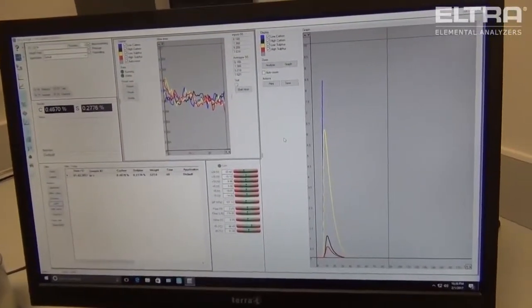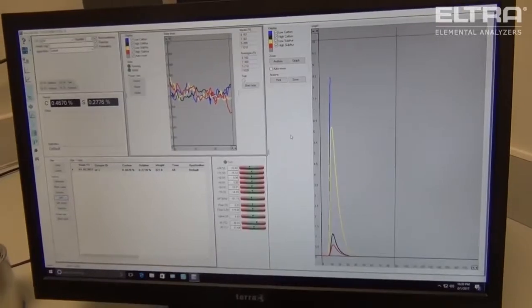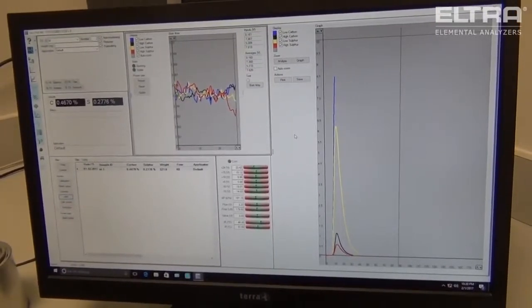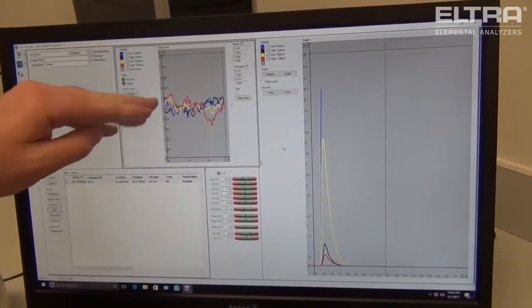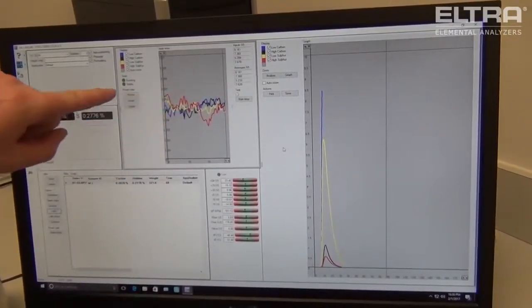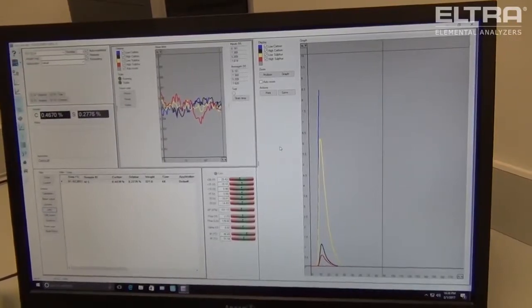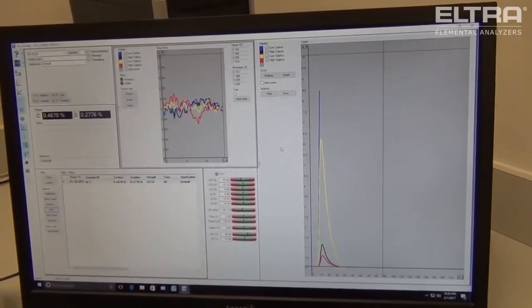Here you can see the baseline for the system while it is in its steady state. You can see jumps around in between detectors for the IR cells. Once you have a stable baseline, the system will alert you to when it is stable and analysis can begin.